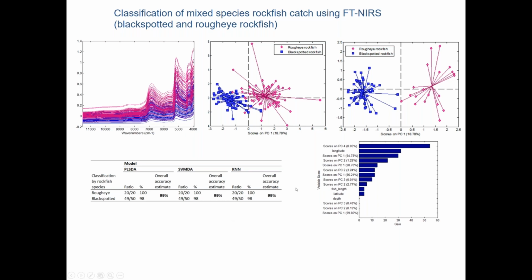Sounds good. And then one other question that might be appropriate right now, and then there's a couple that we can do at the end, but this one's from Catherine Matson, and she's wondering, how does this technique do with crystallized or dysmorphic otoliths, and also how does it deal with plus growth on the edges?